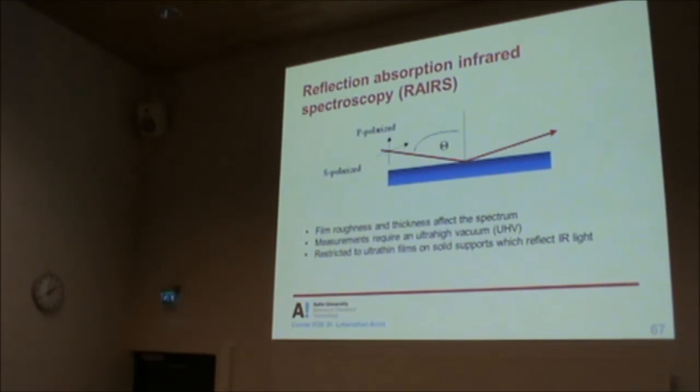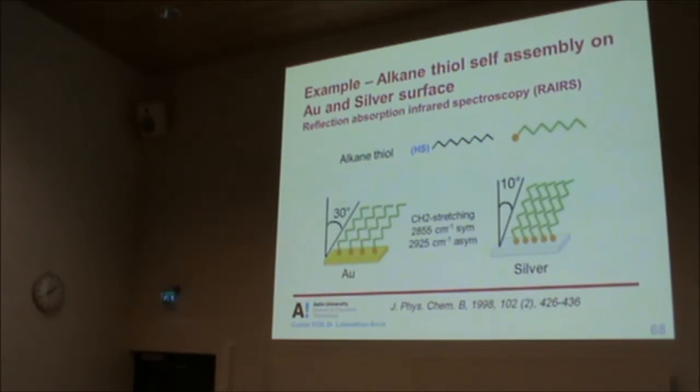So now, in this case, let's say you're sending a polarized light and it's getting reflected. Now, the molecules here are at 30 degrees. On the other hand, in this case, they are at 10 degrees. So in effect, what we are changing is, because of the tilt angle change, this bond orientation is changing. Because of that, the efficiency of resonance between these two will change.